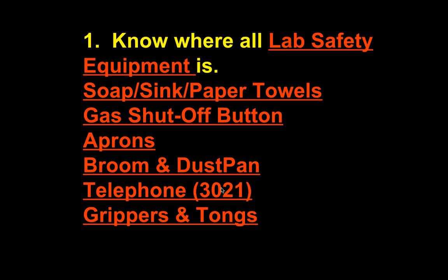Grippers and tongs will be discussed in class — both are used to hold objects. Before we do the first lab with hot glassware, I will show you how these work and how they protect your hands from burns. Another piece of safety equipment: goggles and the goggle cabinet. You will have to wear goggles for some labs — it's a requirement. If you refuse to wear goggles, you'll have to do the alternative, which is typically writing a paper.